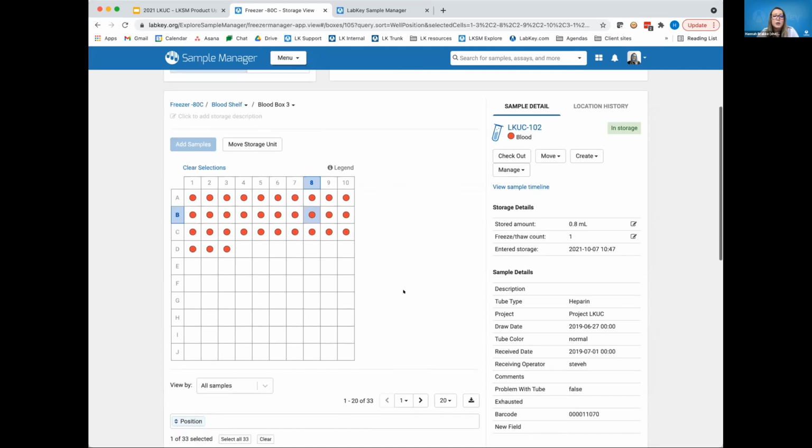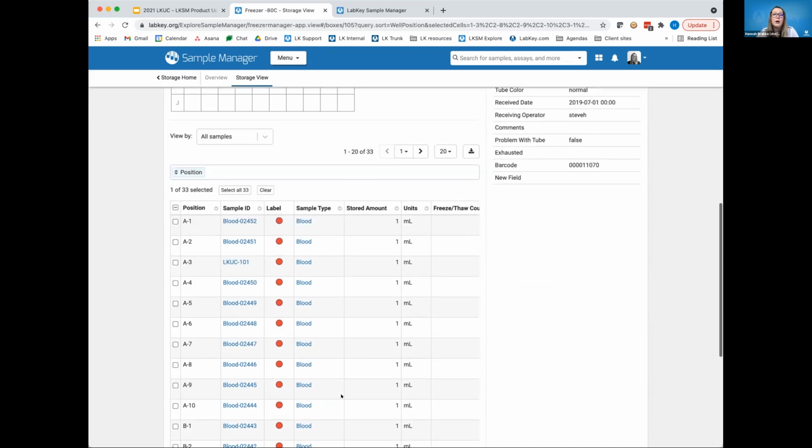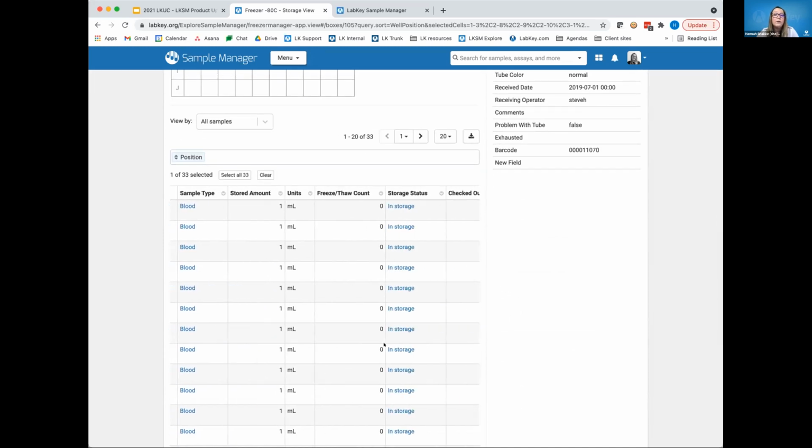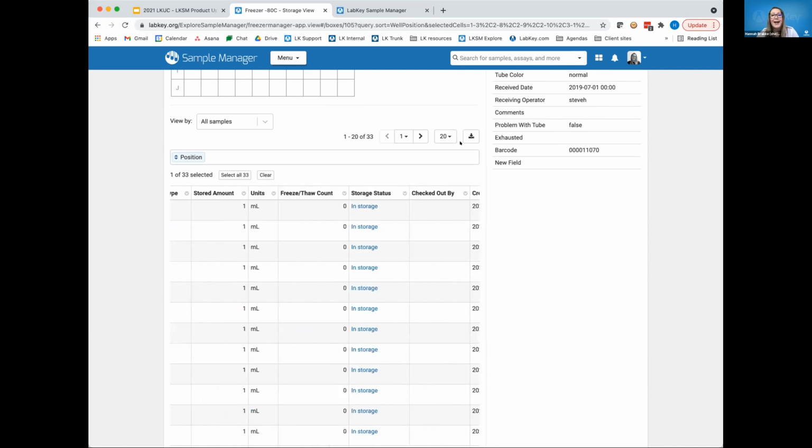Other things that you can do from this view is filter down on the grid view of these samples. And this, I think, is what Anthony was referring to: you can start filtering and sorting along here and export either a manifest or a file that could actually provide some input value for instrumentation or other things as well. And so you could very easily just export this grid and send this box out to your collaborators or to an associate if needed.